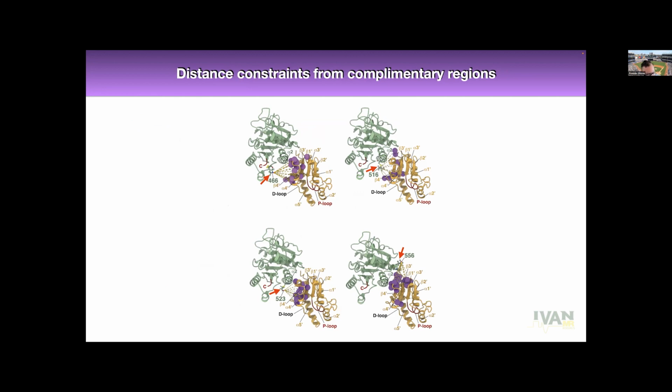One of the things to remember, which I should have mentioned here, I should have had a slide, but of course I forgot to do it, is that when you're using a spin label species or any kind of paramagnetic species, and the PREs here were calculated from resonance intensities of the amide resonances from a TROSY type experiment. Now realize your spin label affects your T2, which is what we're using. It also affects your T1, right?